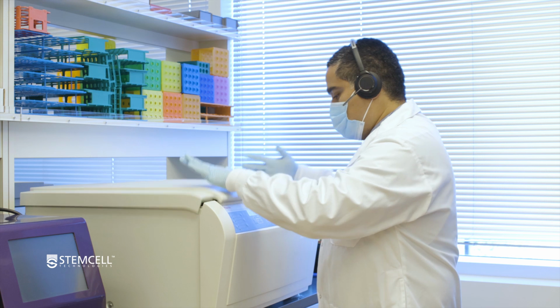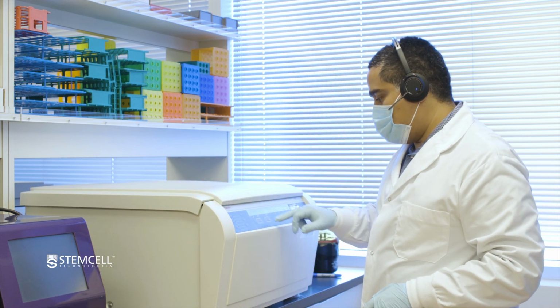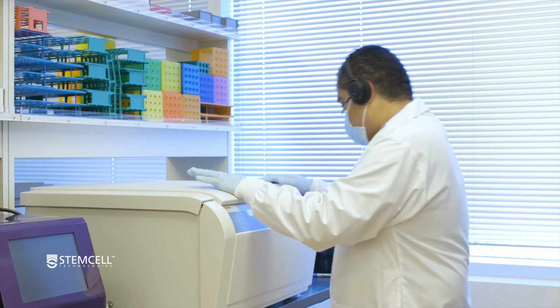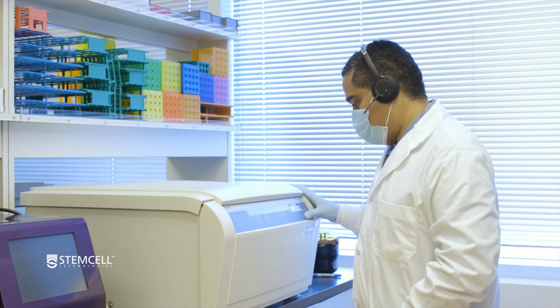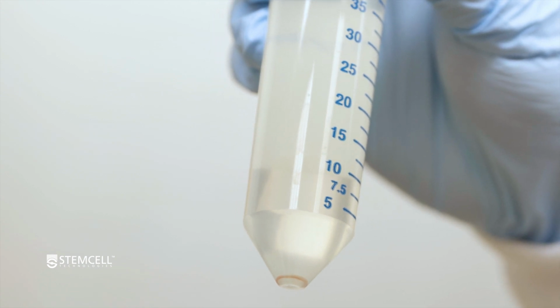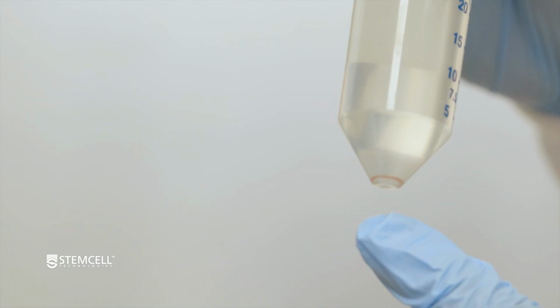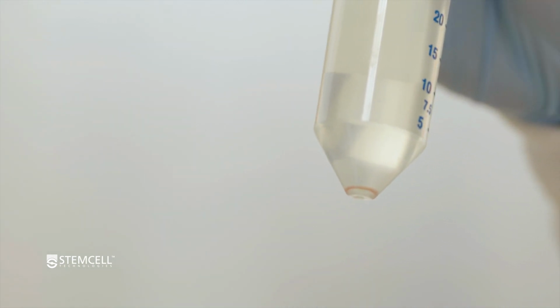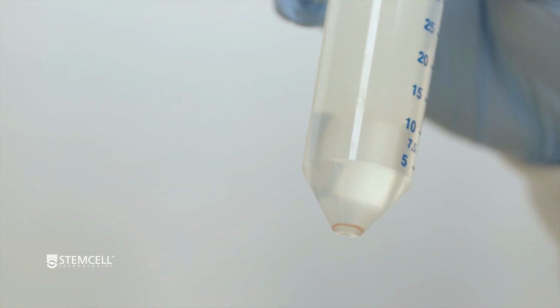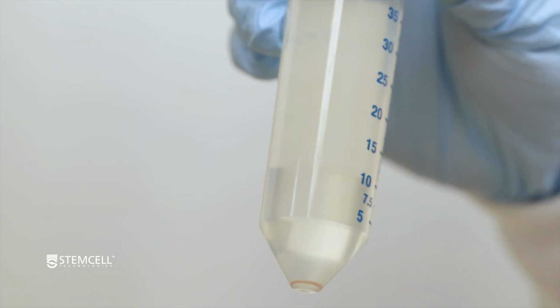So it's going to close this up. Okay, and then we have 300 times G, 8 minutes, acceleration on, deceleration on, start. So here we have, after the first wash, we did 8 minutes for 300 times G. You can see here that there are a few red blood cells along with your PBMCs, and that is perfectly normal. This is very similar to what you would see with or without the SepMate tube. So if you were doing a regular density spin without the SepMate insert, you would also see this red banding.